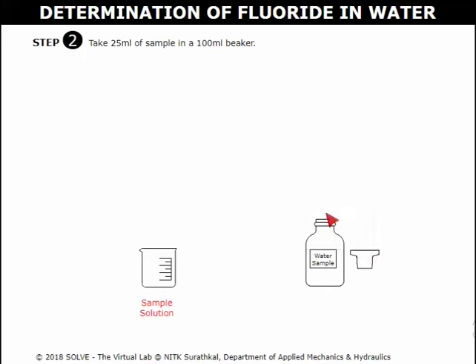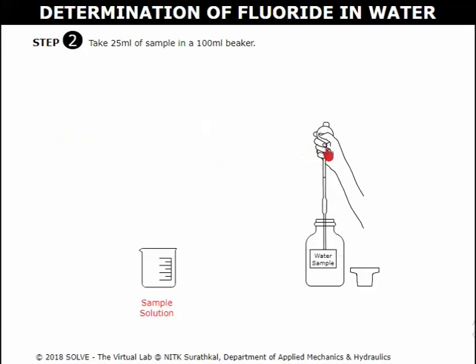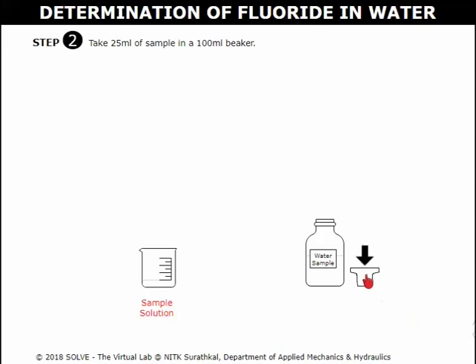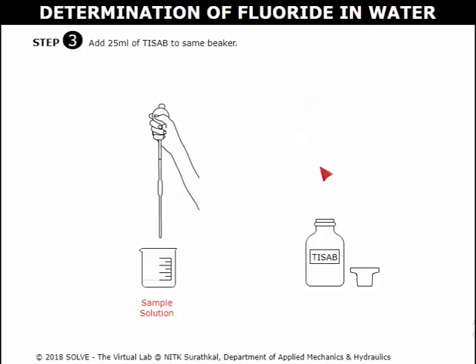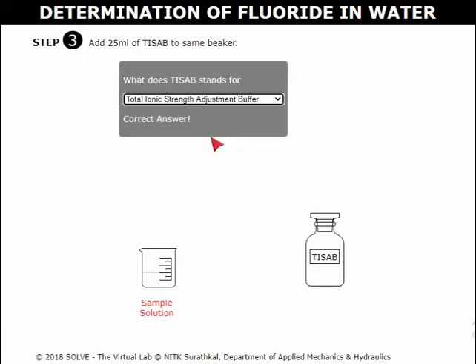Open the lid of the water sample. Click on the pipette to pipette 25 ml of sample and release the sample into the beaker. Click here to open the TISAB bottle and transfer the solution into the beaker. The amount of TISAB taken should be equal to the amount of sample taken, and the total volume should be sufficient to immerse the ISE sensor. Select the correct answer for the pop-up question to proceed to the next step.